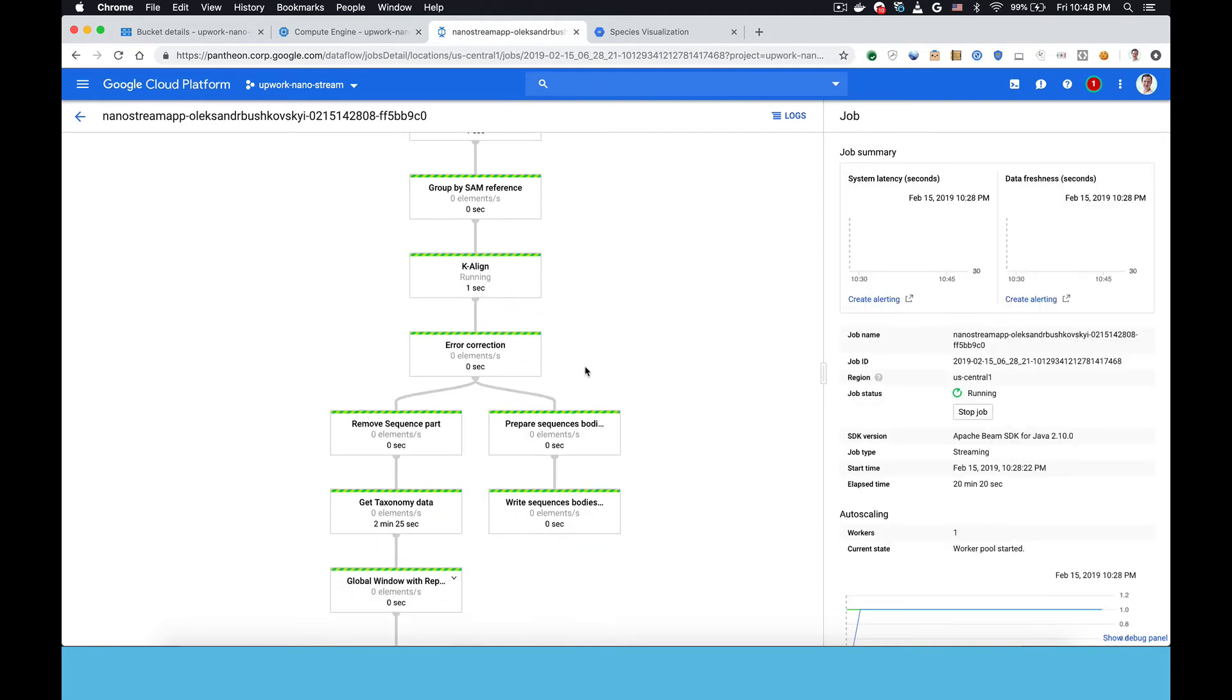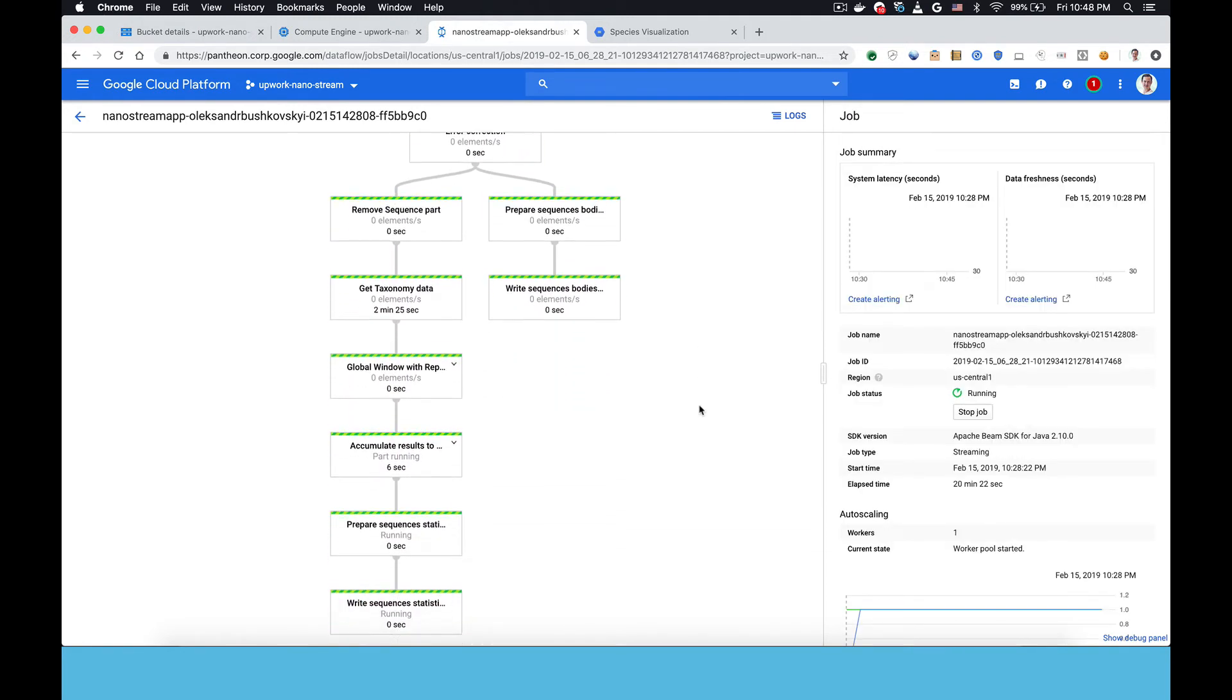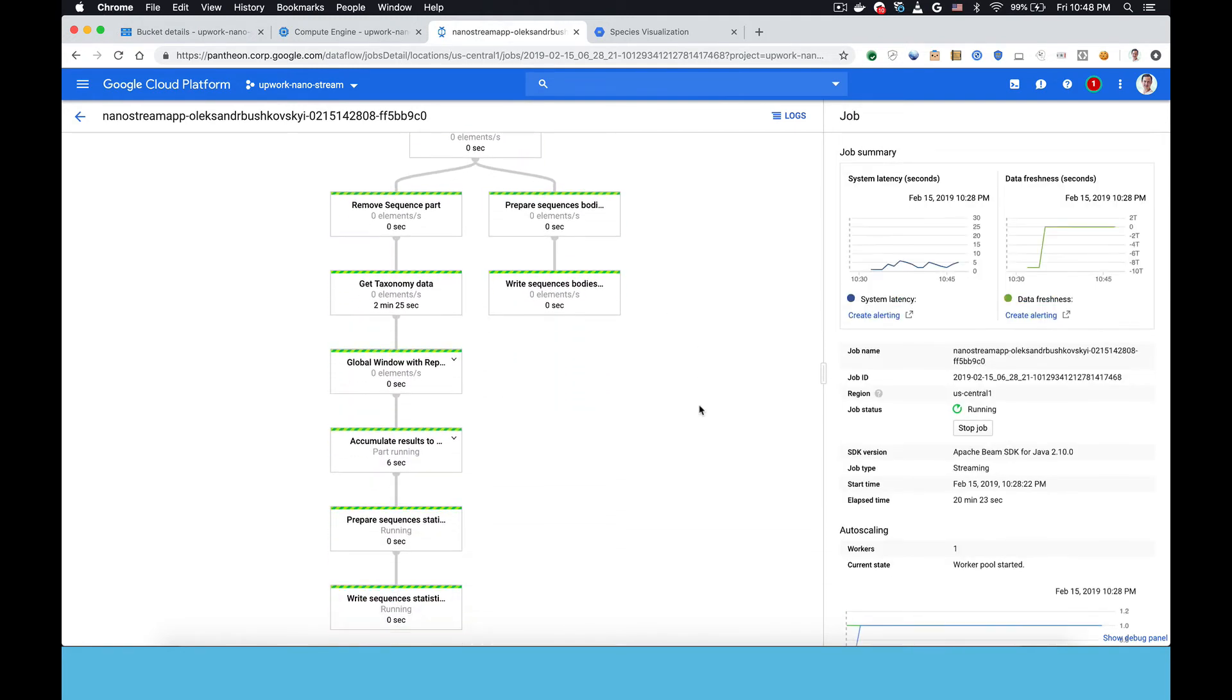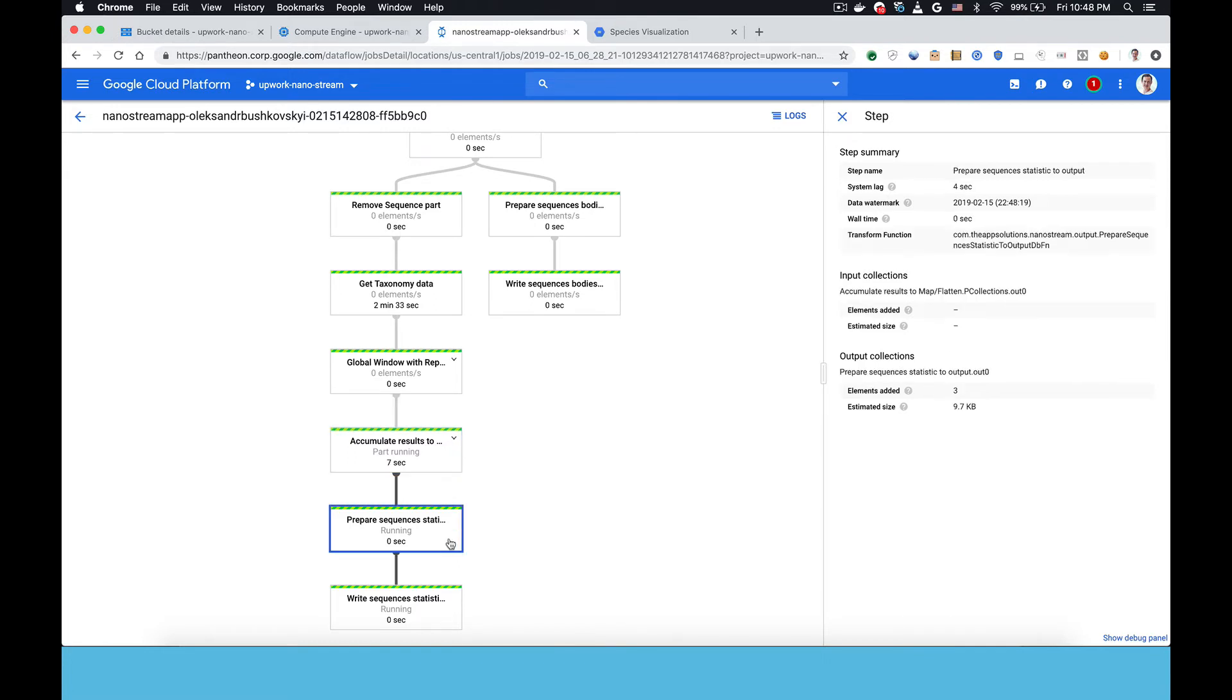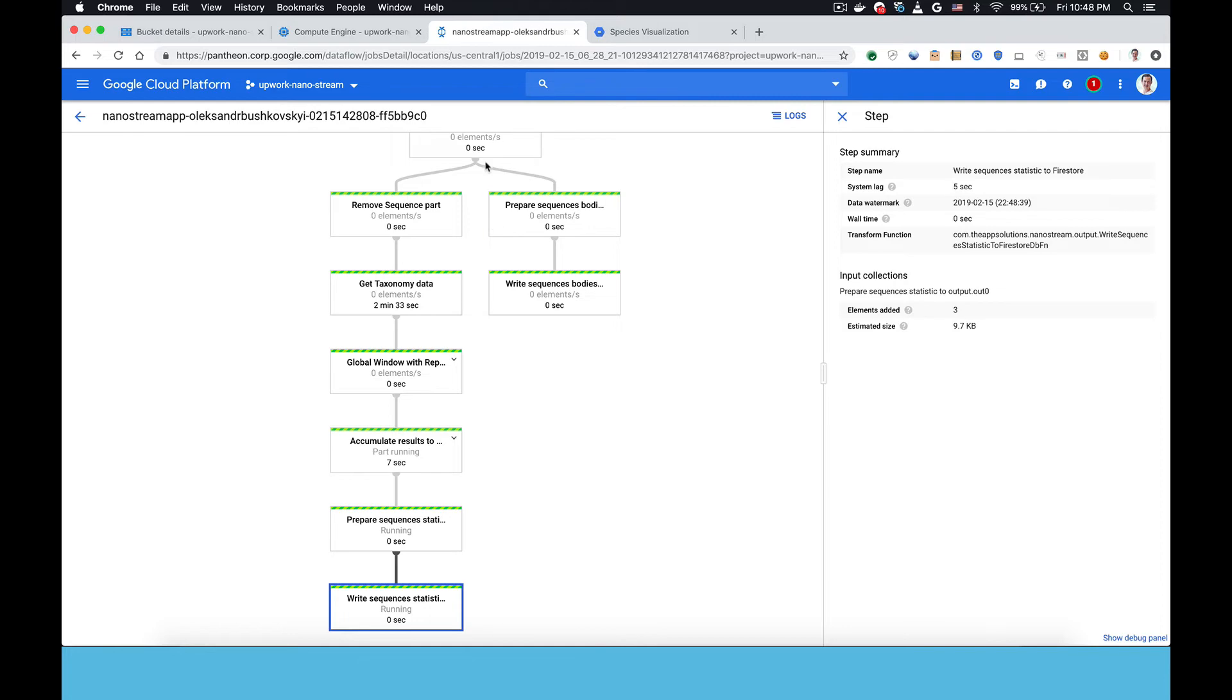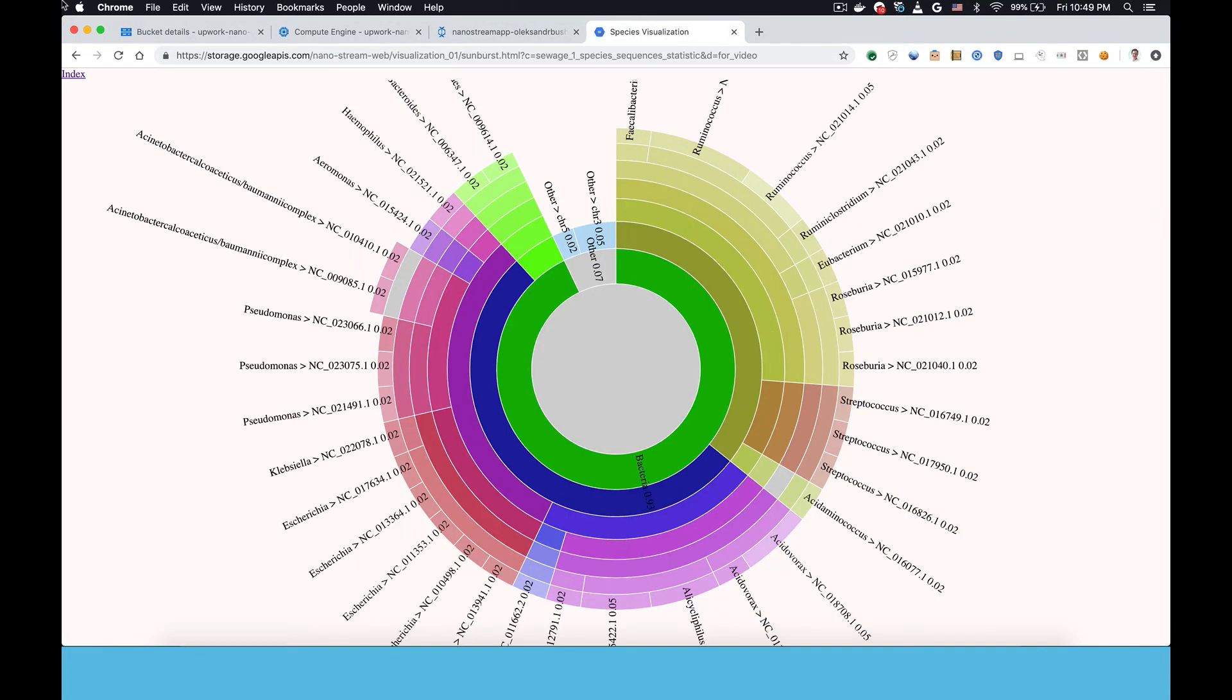This is the rest of the pipeline so you can see there's a bunch of steps that are required to do this processing all the way down to accumulating results. These are species counts essentially that are then written to Firestore which is what's driving the visualization. You can see it updated again.